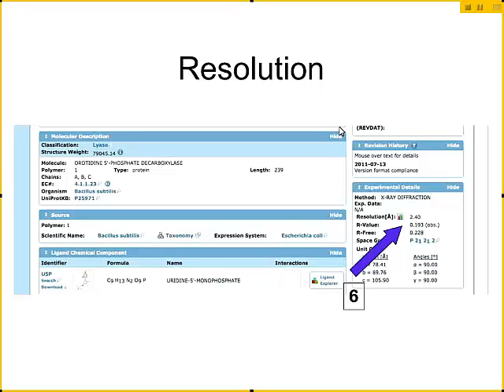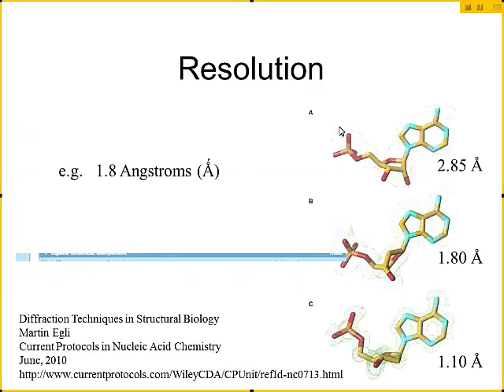The critical information to look at here are two pieces. You don't need to worry about unit cell lengths or angles — what you do need to look at is the resolution and the R-values and R-frees. Those are the residual errors.